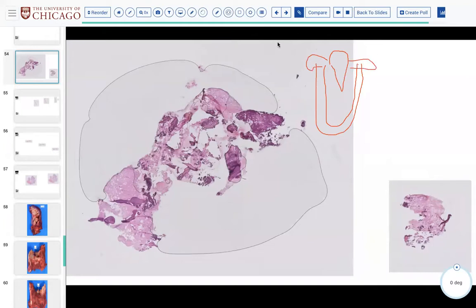And so what they're trying to do is take stuff from here. They're chunking out the marrow of the mandible to send to you to try to freeze. So you're obviously not going to freeze cortex. That's just impossible, and they know that. So they're trying to get some of the softer marrow stuff that you can actually freeze.